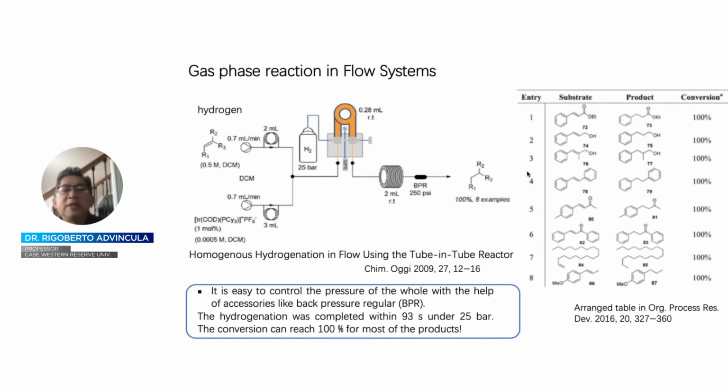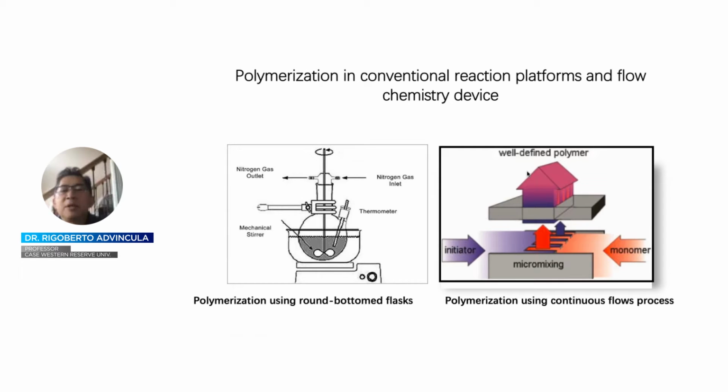So with all those examples from monomer synthesis to polymer synthesis, let's look at some of the work we had done to demonstrate the viability of reaction under continuous flow chemistry compared to that of a batch reaction. So again, the advantage here is the environment by which mixing or the entropy is controlled, based on the degree of confinement of space by which you do the mixing.